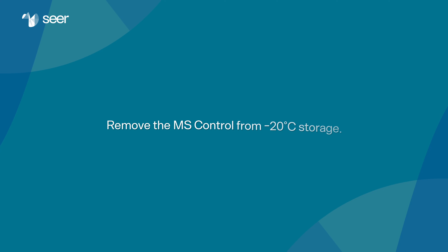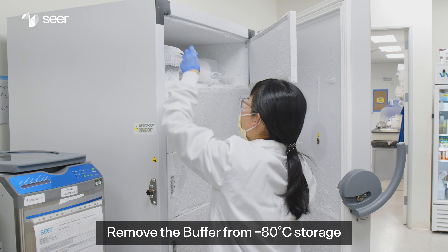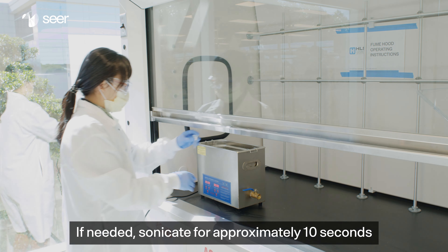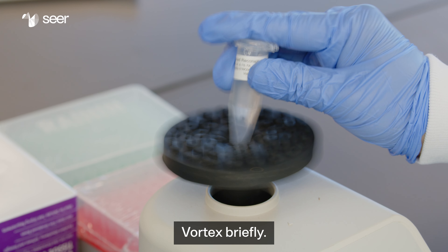Remove the MS control from minus 20 degrees Celsius storage. Now we'll prepare the peptide reconstitution buffer. Remove the buffer from minus 80 degrees Celsius storage. If needed, sonicate for approximately 10 seconds in a room temperature water bath. Vortex briefly.